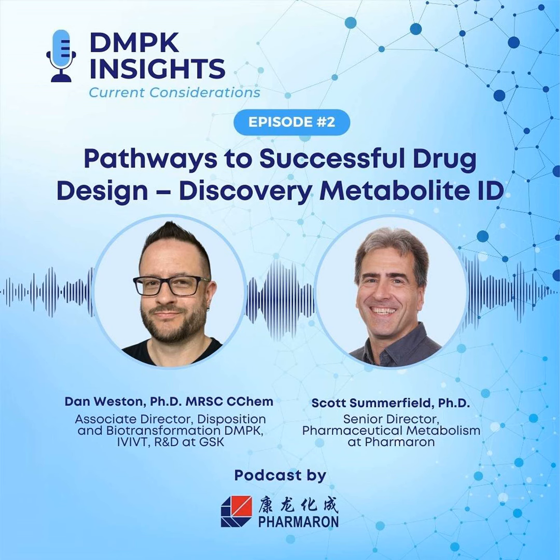From the evaluation and from continual use, applying it at the coalface with projects, what we've seen is something I guess we've always been aware of, the potential for prediction bias. Metabolite predictions are tremendously useful, of course, but it's the way that we apply them, and we've been using manual intervention, manual data interrogation, to minimize that bias.